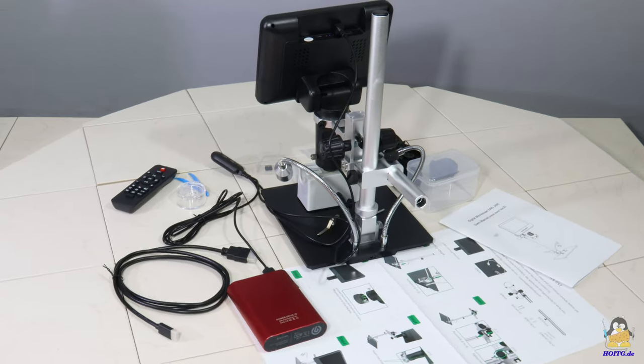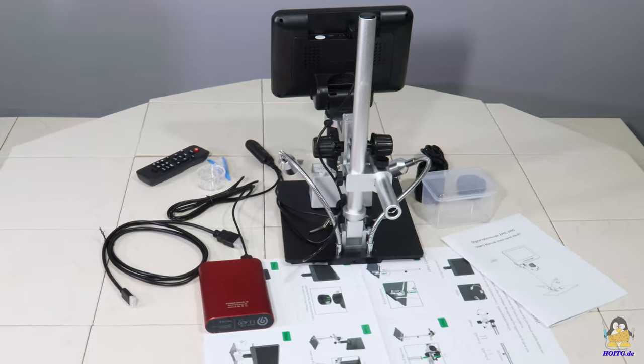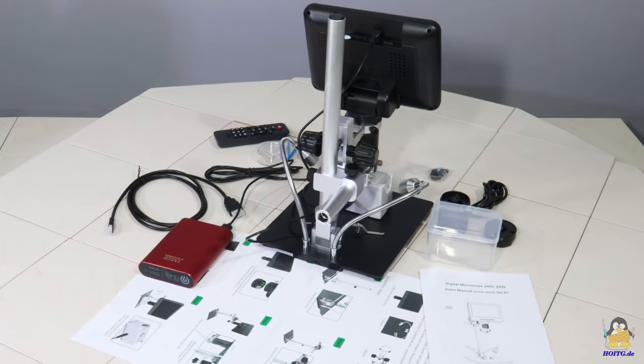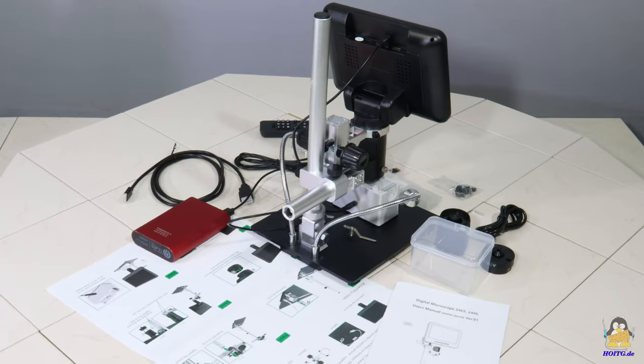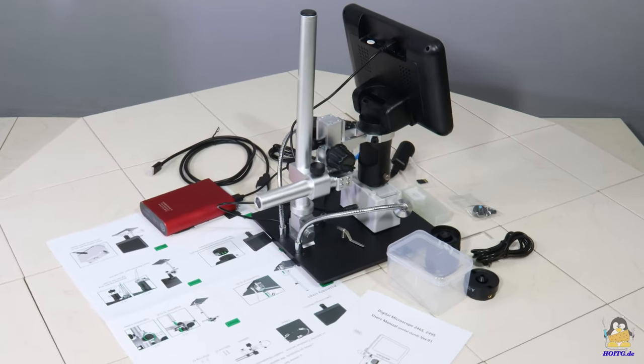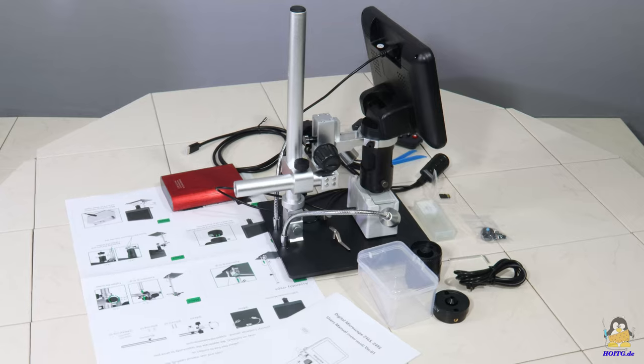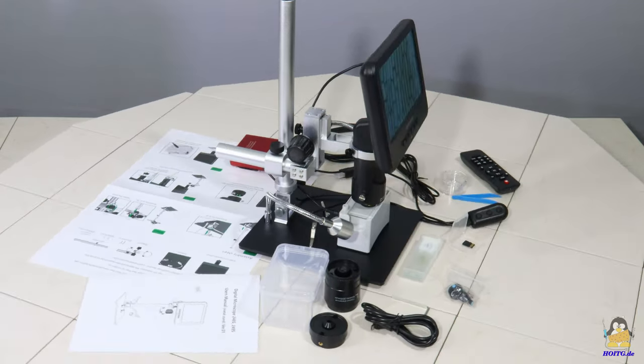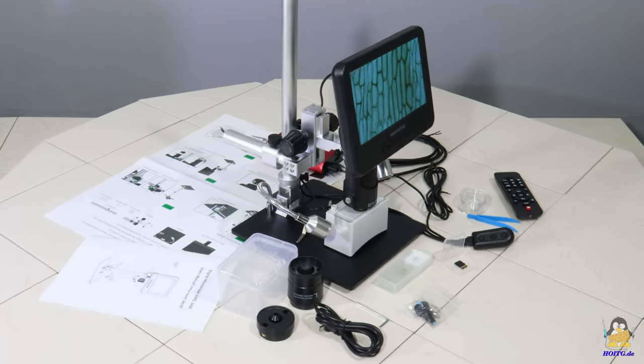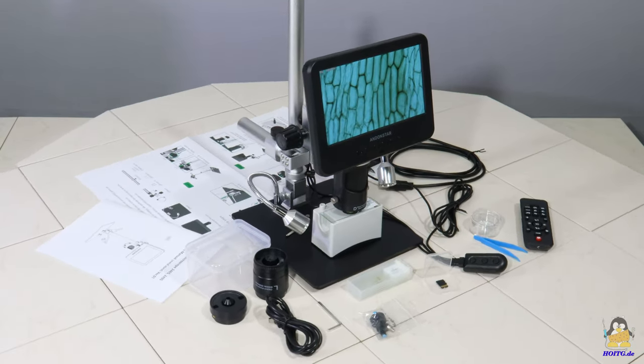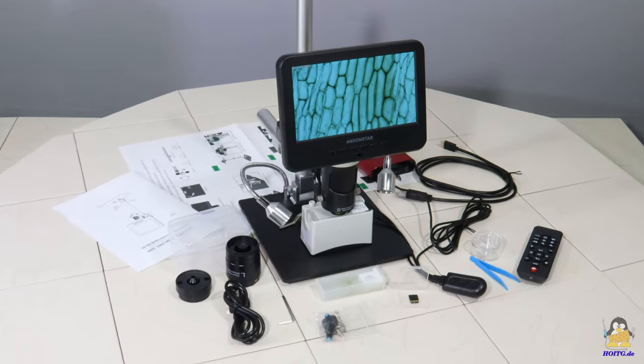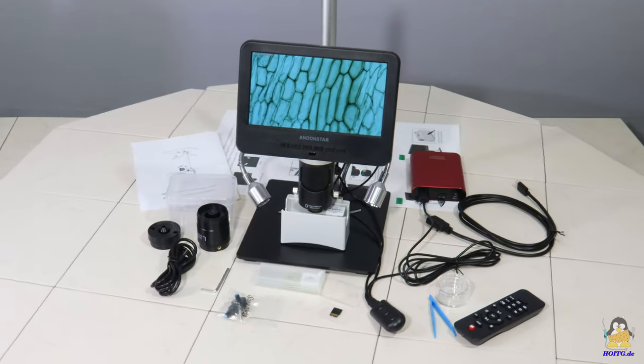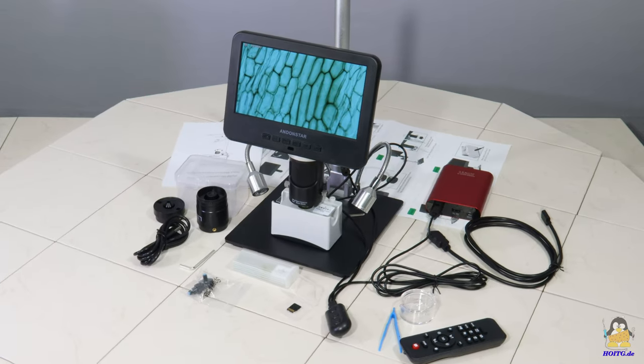I received a microscope type AD246S from the company AndonStar. Two things made a lasting impression on me from an early age: magnets and optical lenses, so I gladly accepted the offer to test the microscope. In addition to the microscope, the package includes a 7 inch screen, a total of three different lenses, light sources for reflective and transmittive microscopy, a couple of slides with sample preparations and some small parts.